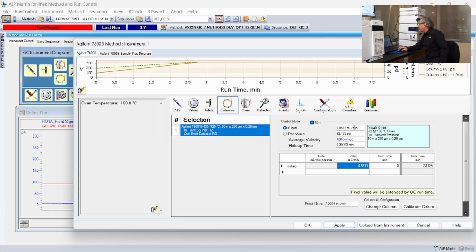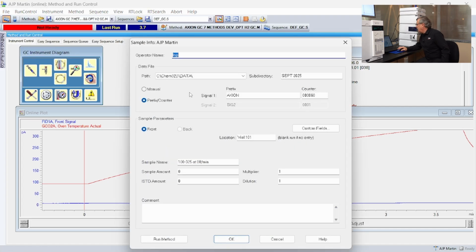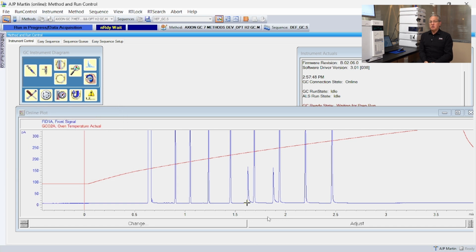So for it to do that, it's now applying a lot more pressure, 32 psi. We'll keep the temperature program alone. We could go higher if we wanted, but the GC really can't keep up above 80 degrees per minute. So let's go to run control and tell it linear velocity, which is mu equals 128. And we'll do this as our one last run to see ways to not only develop a method, but to also optimize the method in terms of time.